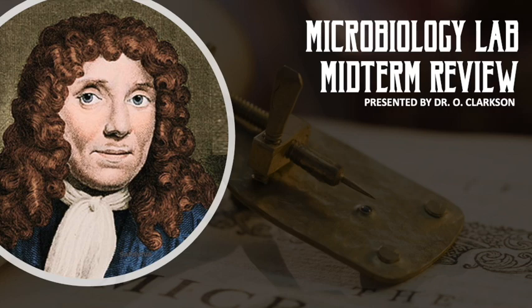Isn't that wave aperture? Yeah, so that's going to be for resolution. So magnification is going to be one element, and then resolution is going to be the other element. And resolution is going to be determined by wavelength, as well as what you said, the numerical aperture. The thing that you look into, the lens that you're looking into. Is that the ocular? Yeah, the ocular lens. The one that rotates at the bottom, what's that one? Objective, great.